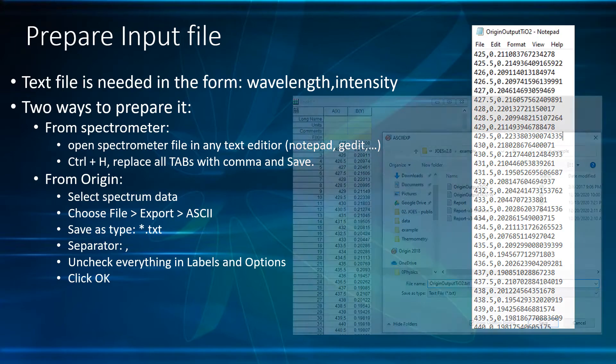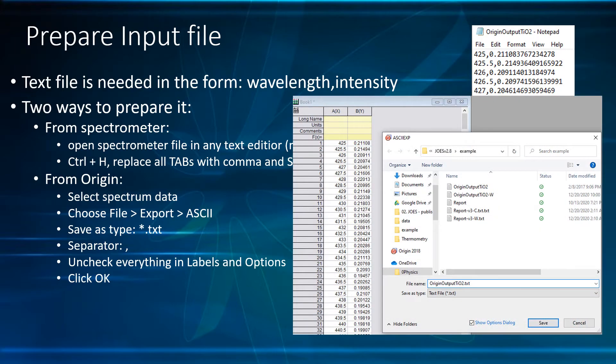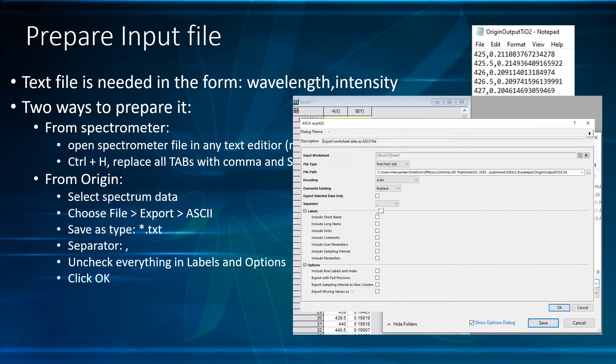From Origin, select Spectrum Data, choose File, Export and ASCII, Save as Text File. Choose comma for the separator and uncheck everything under Labels and Options.